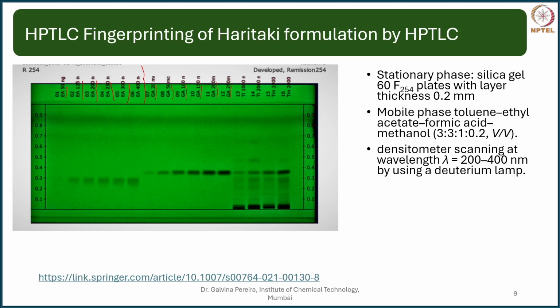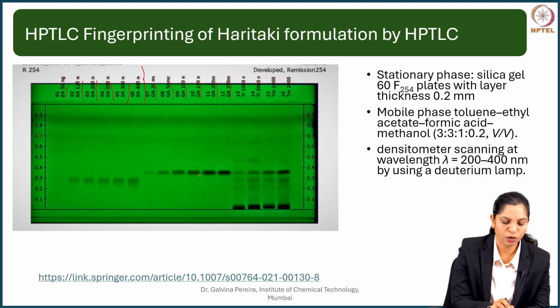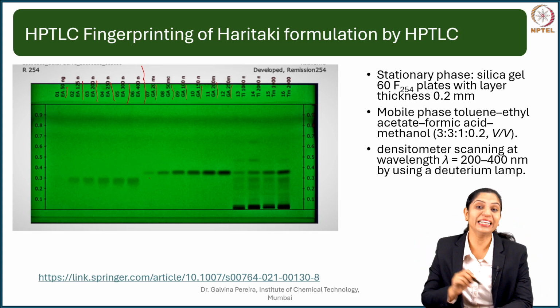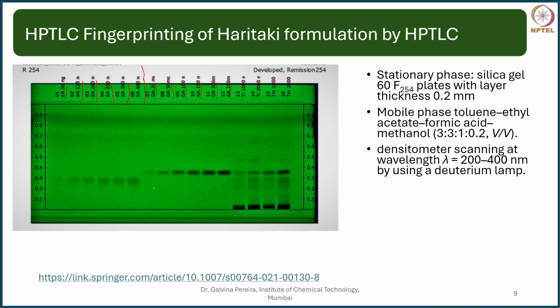So here what happens is, you have again your standard curve, and now once you have your standard curve of ellagic acid, standard curve of gallic acid, you know that their area under curve is going to go on increasing as the concentration increases. You can even visibly see their density is increasing. So their intensity of peak will also increase as the concentration increases, and overall area under curve will also increase with concentration.